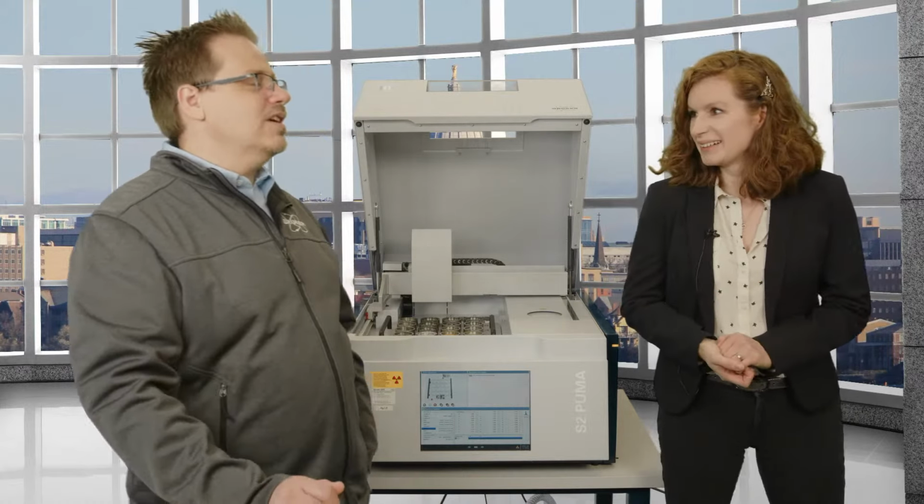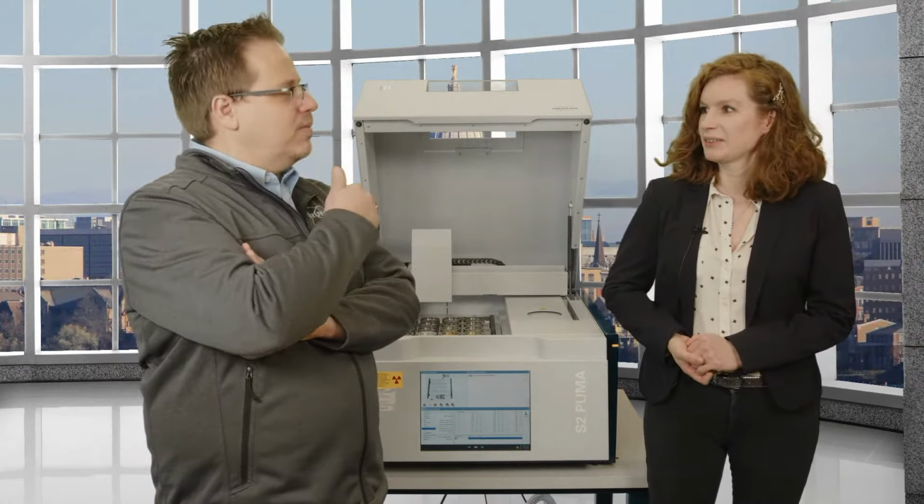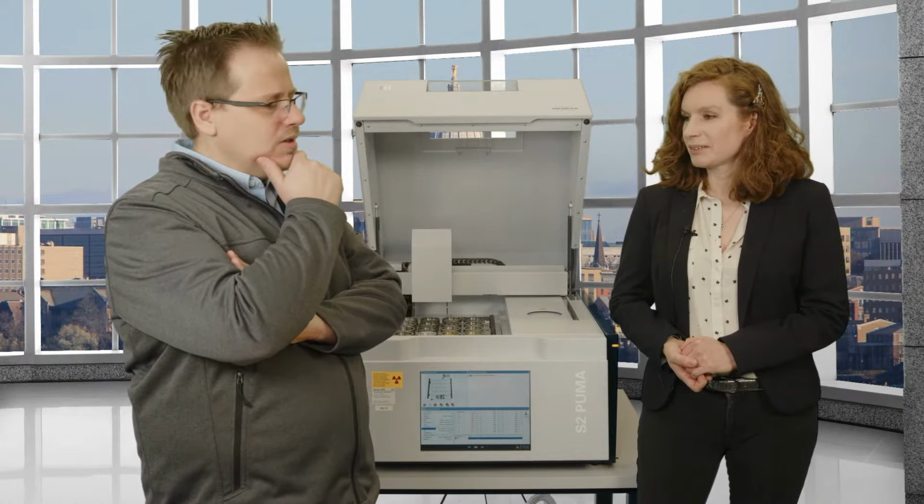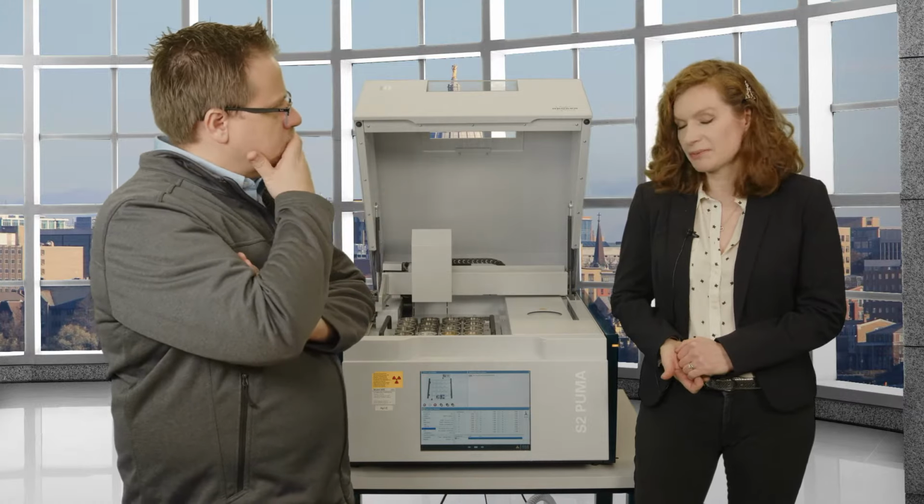Yeah, because that's one of those things where somebody would come to me and ask, how do I measure how much bone is in this? And from the first half, you're wondering, visually, how do you do it? Yeah, because you wouldn't see it. But you use calcium, huh? Yeah, you can use calcium for that.